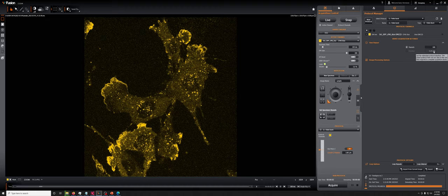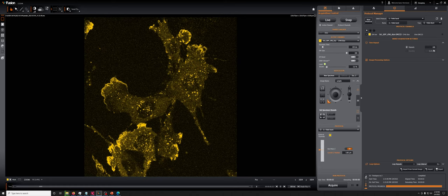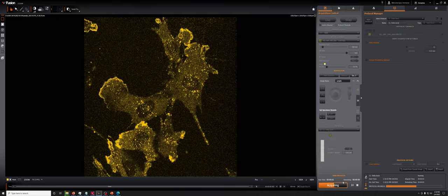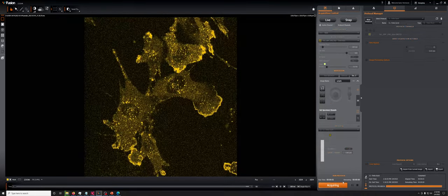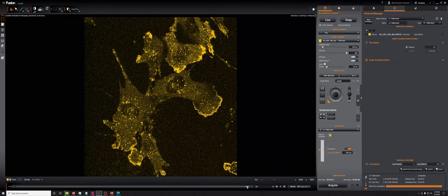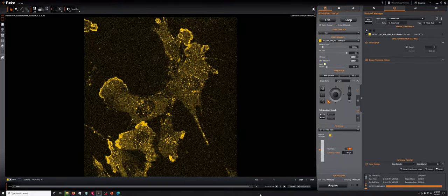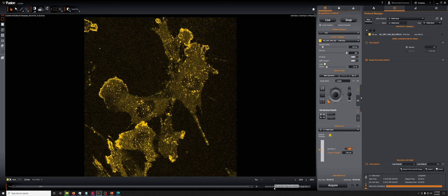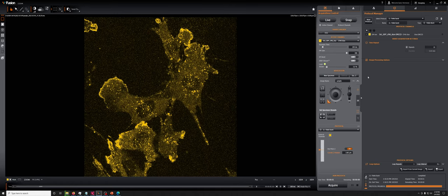So if in this situation you do 11 repeats and acquire, if we look at now the difference between the first and the second frame, there's only one extra millisecond compared to before when there were 44 extra milliseconds. So that really, really helps a lot.